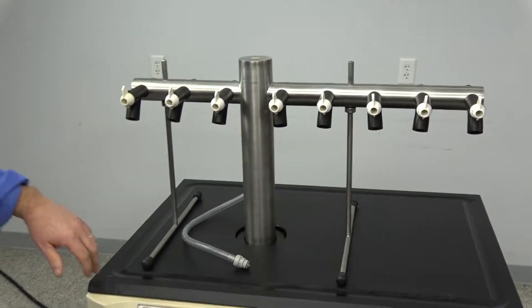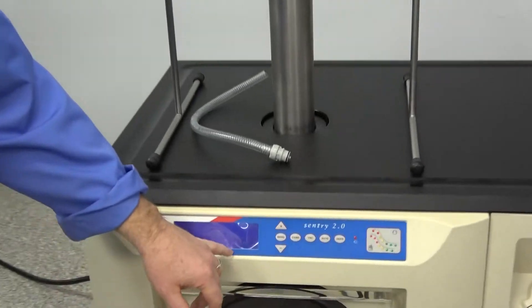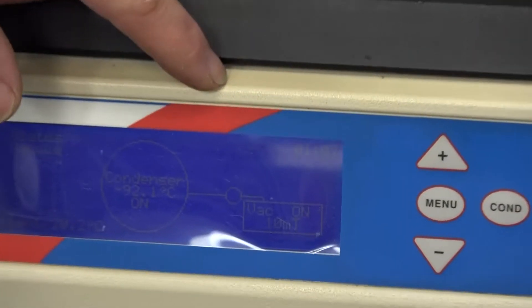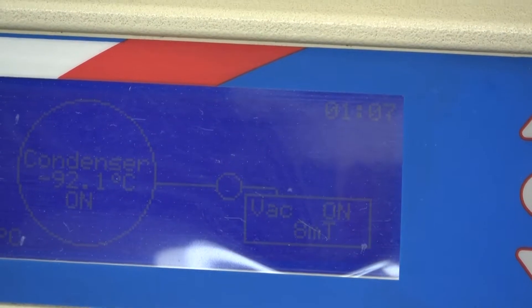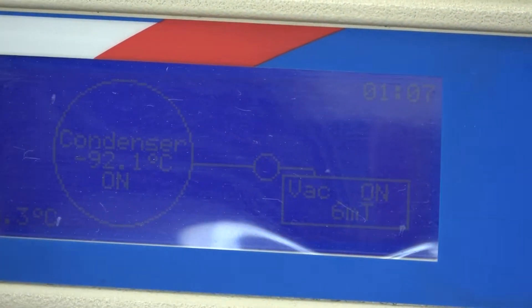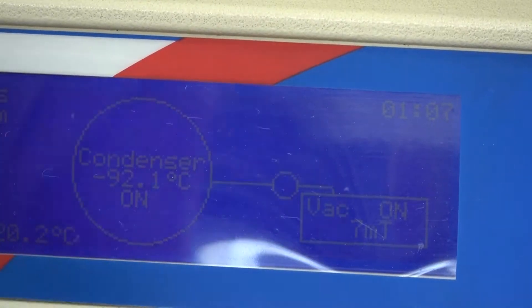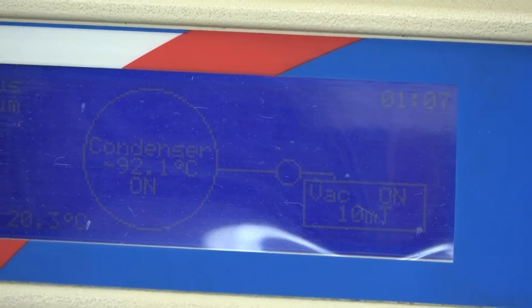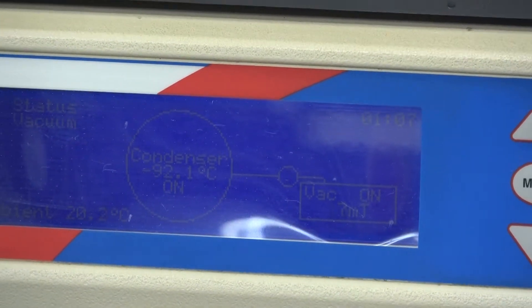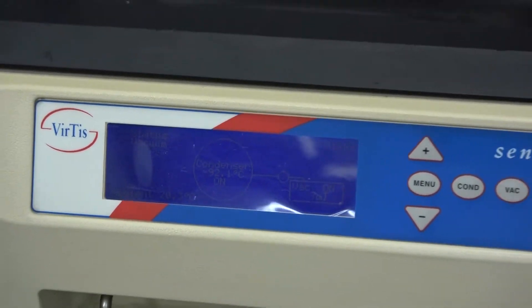But I just want to point out here, we're pulling down well below the specs. You probably can't see the screen too well, but it's bouncing around six and seven millitorr here. We're showing about a negative 92 Celsius on the screen as far as the cooling temperatures. Like I said, just a great running machine.